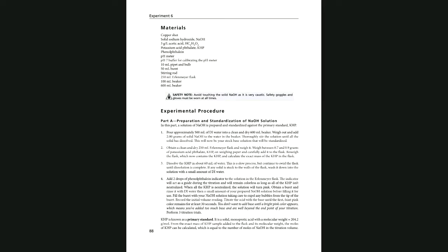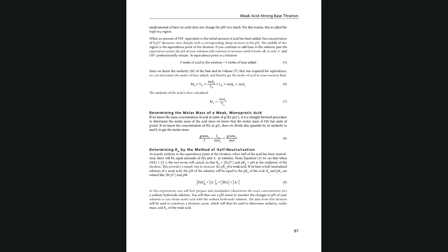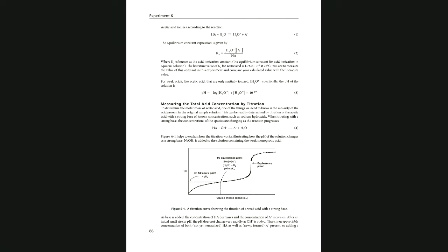I just wanted to show you the graph for the equivalence point and what half equivalence means, which is you divide this volume by 2, whatever it is, you find it in the graph, and then you find the corresponding pH, which is equal to the pKa.